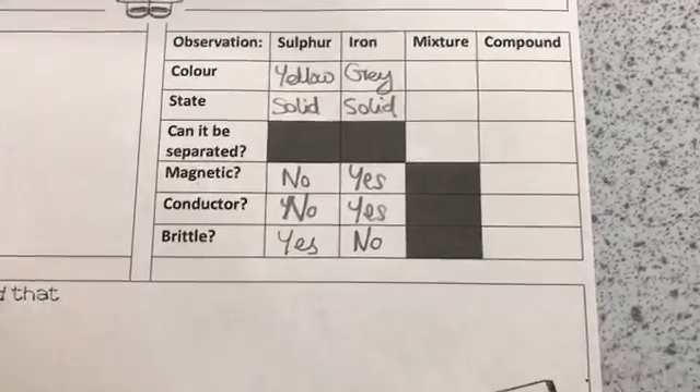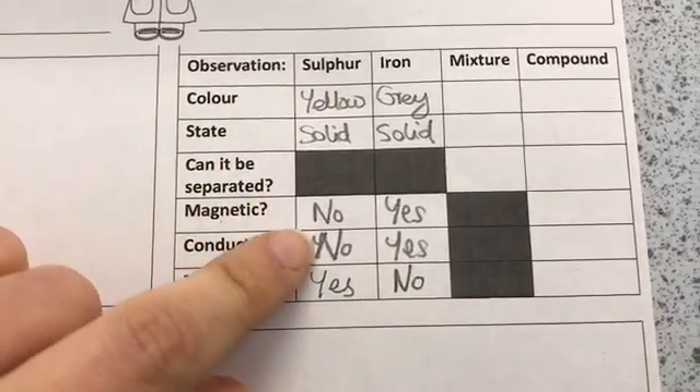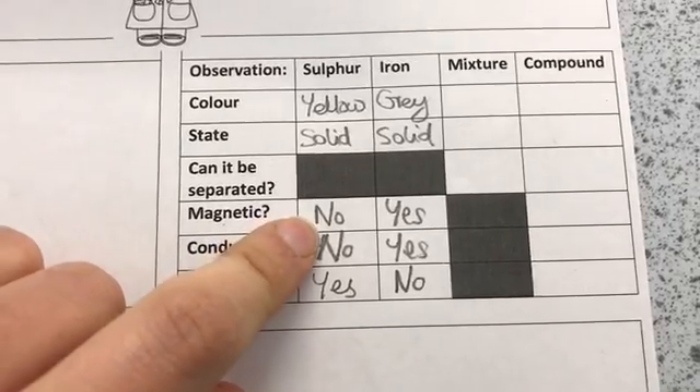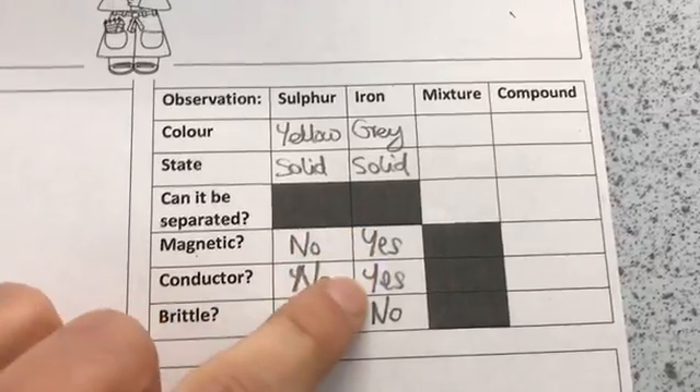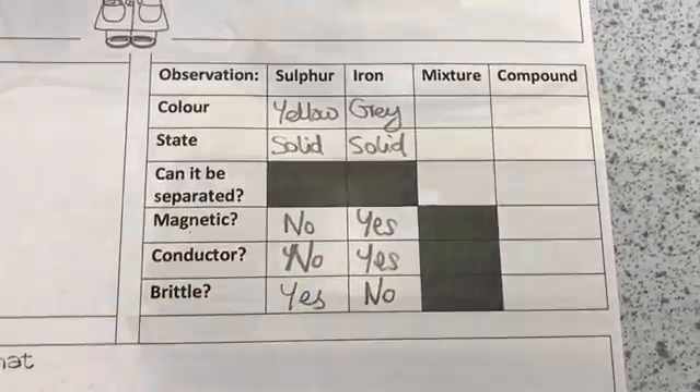You should now have filled out the first two columns of your table. Sulphur is not magnetic, it's not a conductor, and it is brittle. Iron is magnetic, is a conductor, and is not brittle.